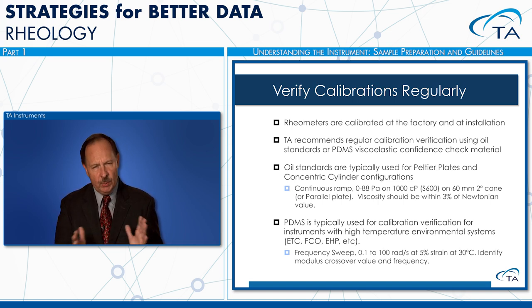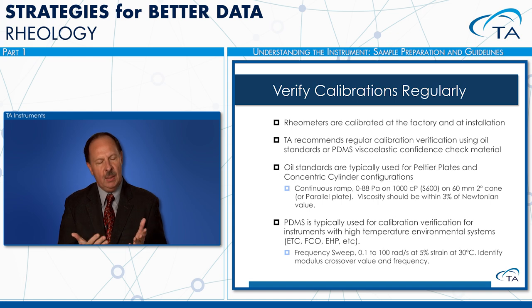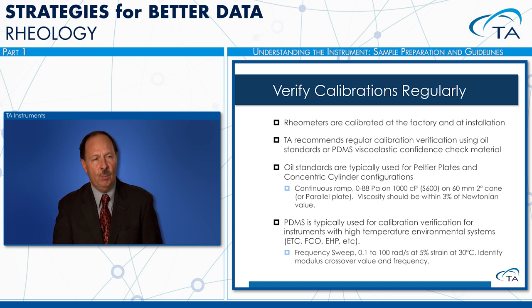So if you do get strange data, it could be maybe the test isn't set up right, or maybe there's something wrong with the sample labeling. So these are things to keep in mind. We want to make sure that you can reject the notion that there's something not right with the instrument. When you first get your rheometer, it will be carefully calibrated at our manufacturing facility, and we recommend using standard oils that you can get.